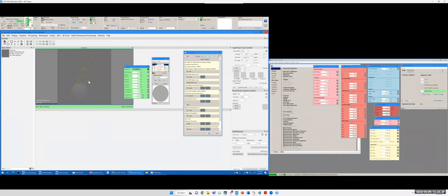Normally for every microscope, you want to define a particular line, an optical line, we call it the optical axis, right? We want to first align the beam to this optical axis of all the optical elements. We also want to align the apertures centering on this virtual optical line. So we want to draw a circle here and then go to edit, align circle to center. This is the center of the CCD, because we need to define something we can align, right? Nion recommends using the center of the CCD as the center of the virtual optical axis for this alignment. Okay, so we have this circle.